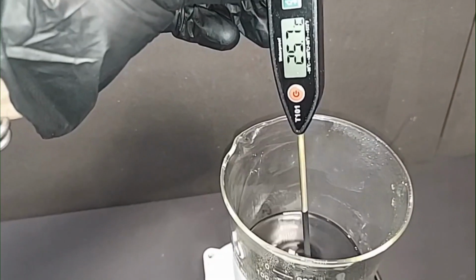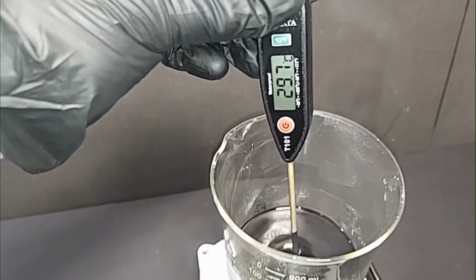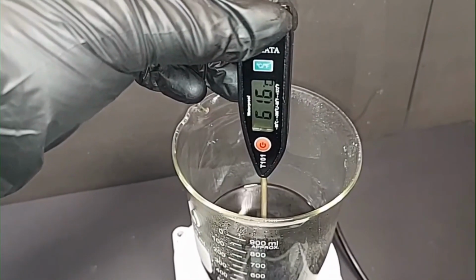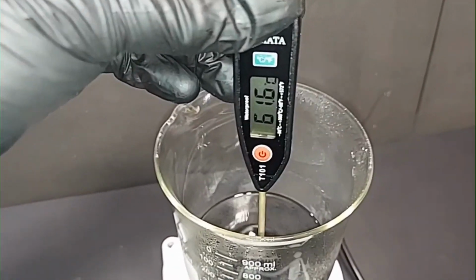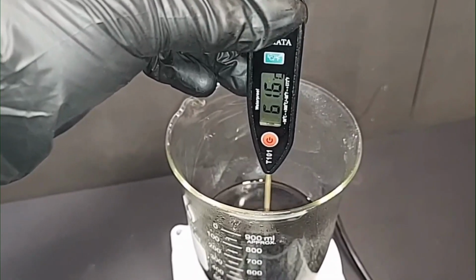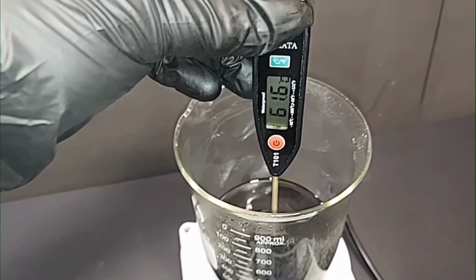Just a gut feeling. It's almost time to turn the heat off here, and I just want to check the temperature one last time. 61.6 degrees Celsius. Okay, the whole time it's been between 55 and 65 degrees Celsius. It's been slow, but that's exactly where we wanted the temperature.